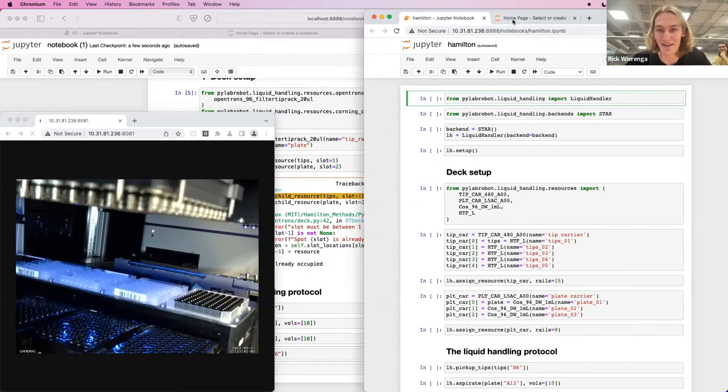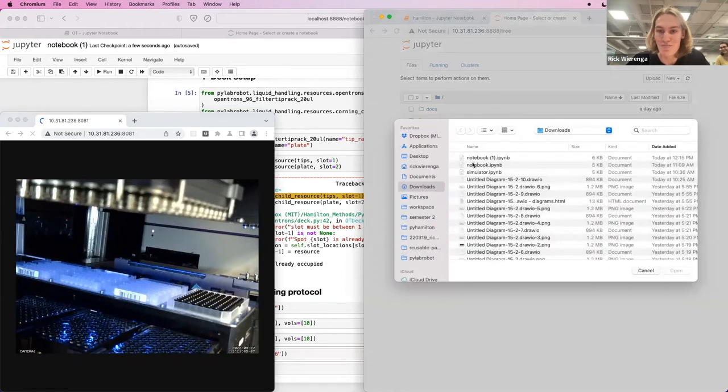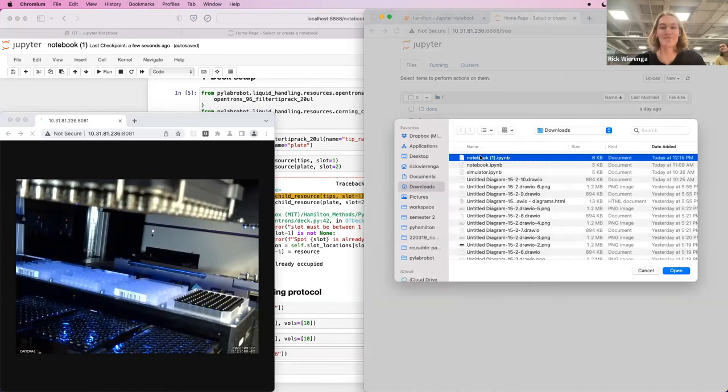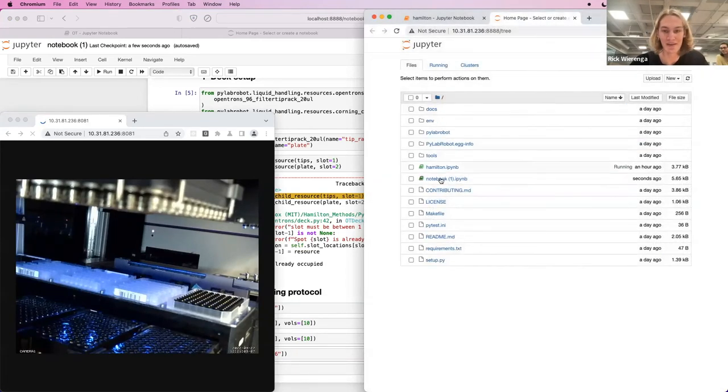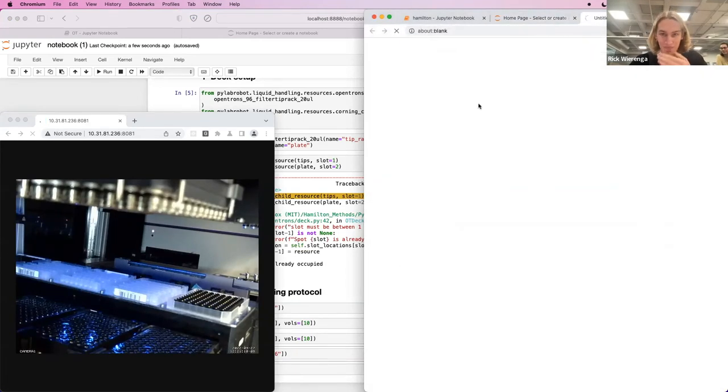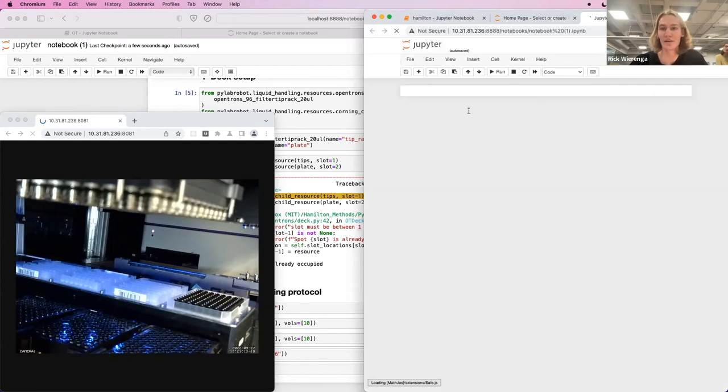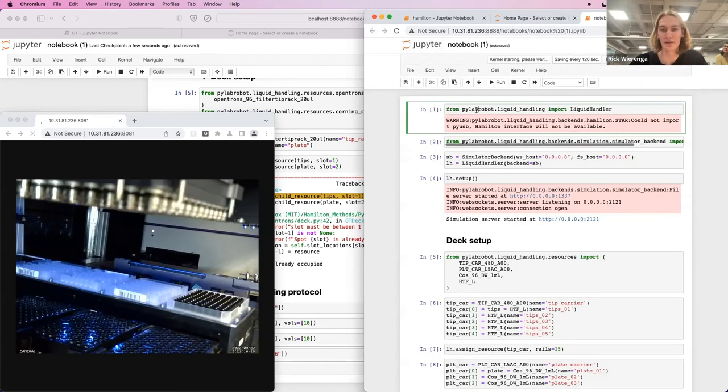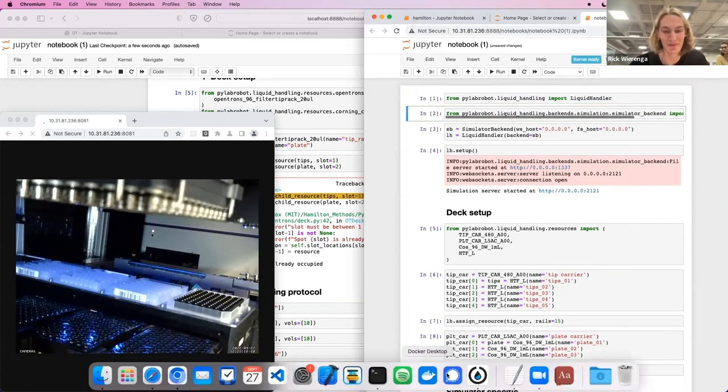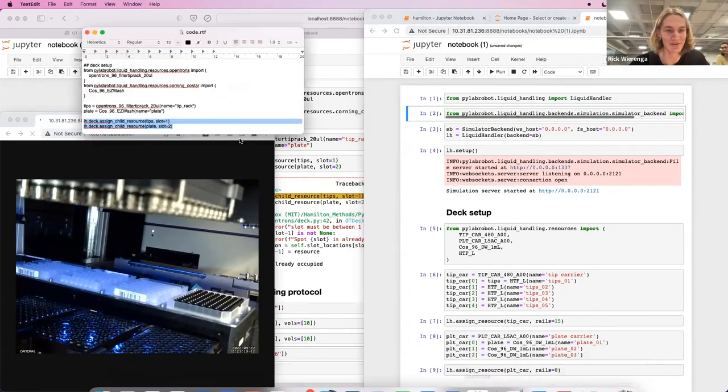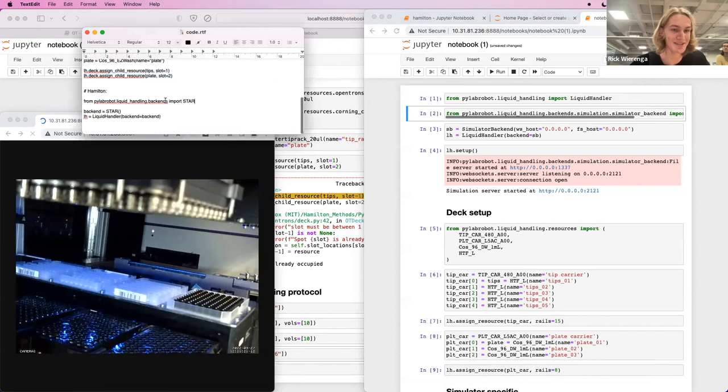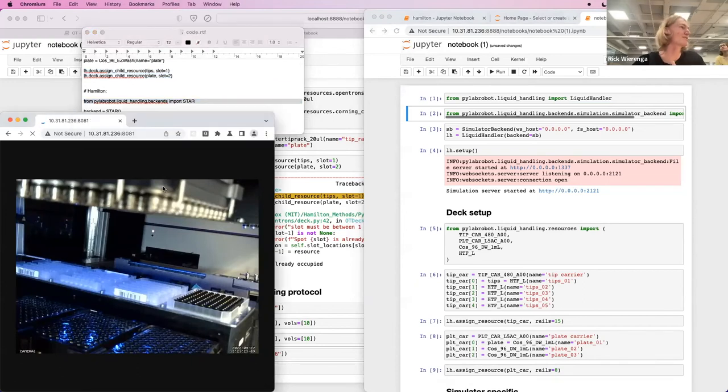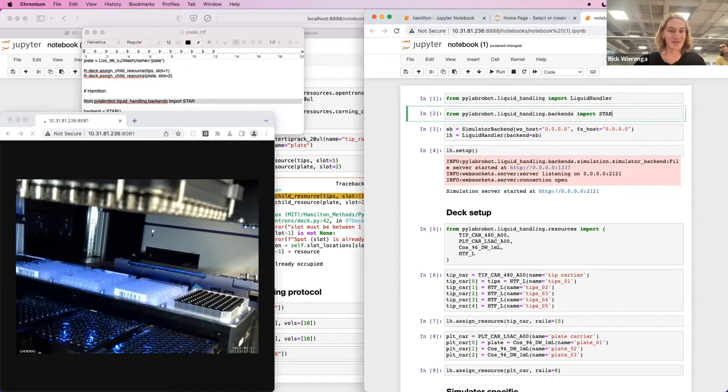And then here, I'm gonna upload the same notebook we just wrote in the simulator. We can again import liquid handler. We have to do some things we just did. There's a little bit less of a reconfiguration since the simulator currently works best with the Hamiltons.